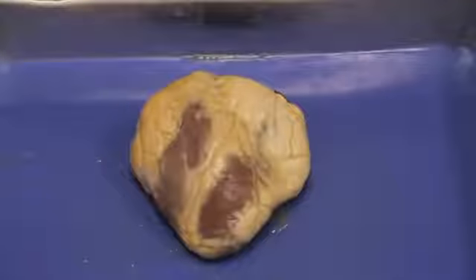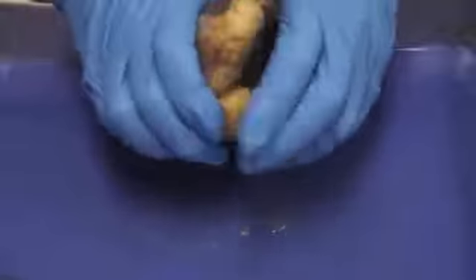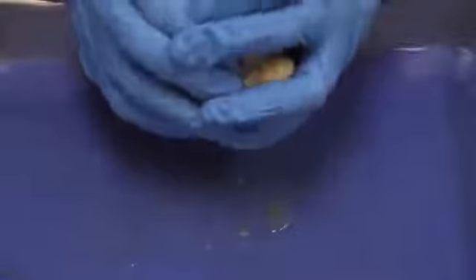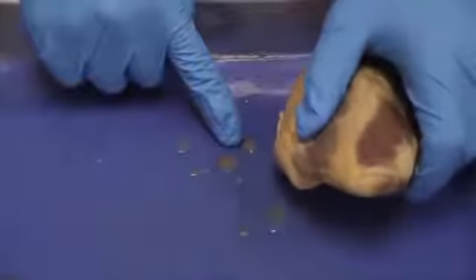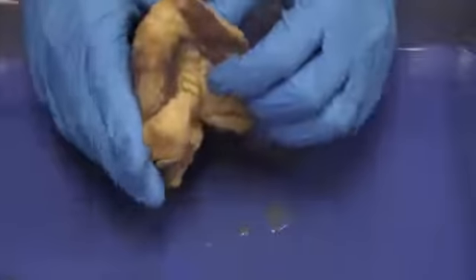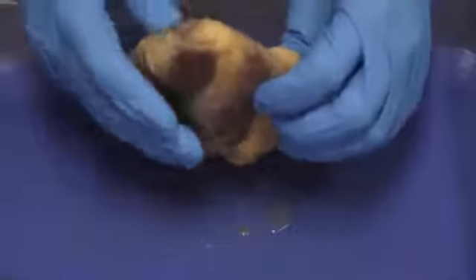Let's identify some external features of the heart before we begin cutting, so we know where to cut the heart correctly. First, let's massage the heart with the vessels pointing down to see the proper gestalt or shape of the heart. So I'm just going to massage it around here, the lateral sides, all the way around. Notice the juice that comes out. Point it all the way down so it doesn't squirt in your eyes.